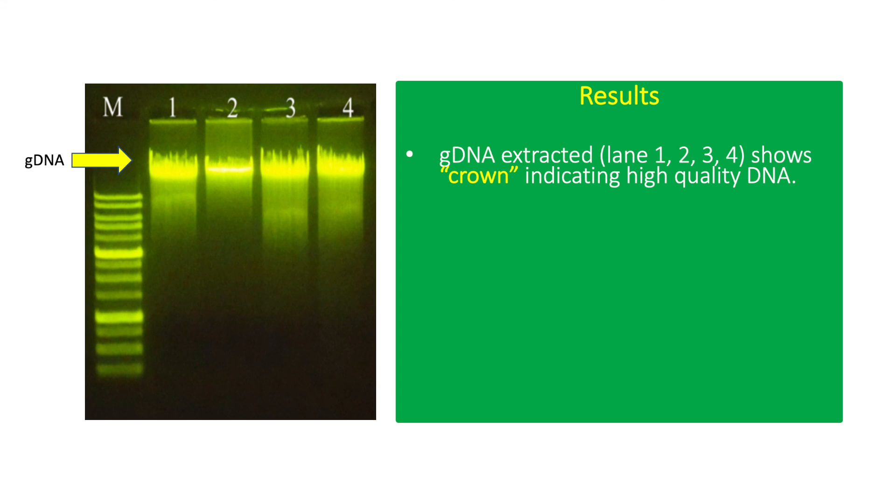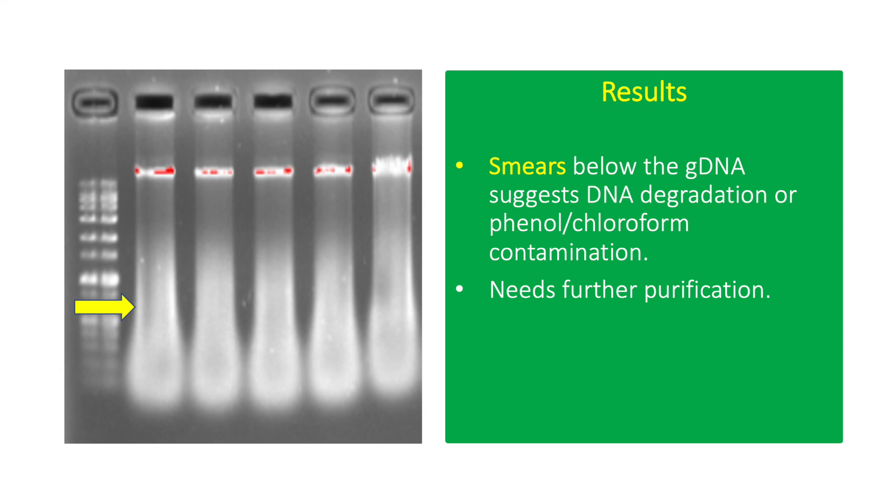This is an actual result showing genomic DNA extracted from bacterial culture using the phenol-chloroform method. The gDNA shows a crown-like appearance, indicating high-quality DNA with minimal degradation; it is commonly observed above the highest band in the DNA ladder, which is around 10,000 base pairs. Low-quality gDNA shows smearing, which indicates DNA degradation or phenol-chloroform contamination — either can significantly affect downstream applications such as PCR.